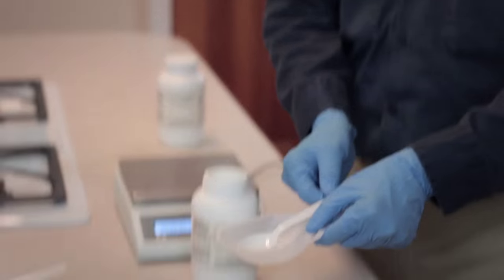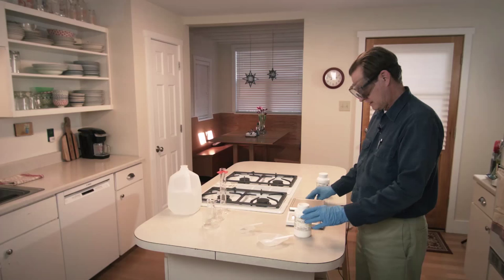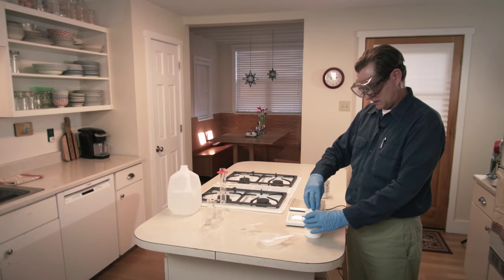I've got 10 and a half grams of sodium hydroxide — I was shooting for 10, but 10 and a half is fine.